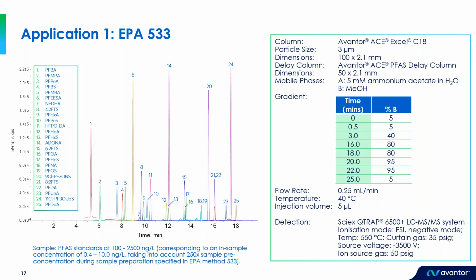So in our specific LC system, the outlet of the mixer feeds directly into our autosampler via a short length of stainless steel tubing. So we simply disconnect the tubing there, connect the delay column to the autosampler, and then use a short length of stainless steel tubing to connect the delay column inlet back up to the mixer.